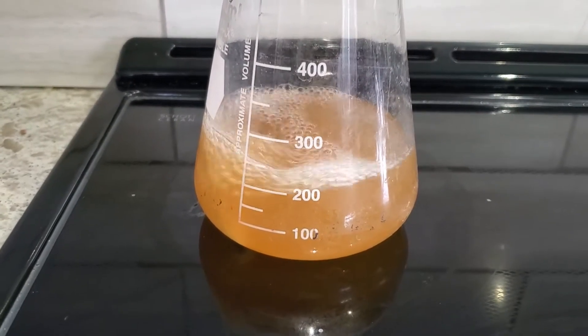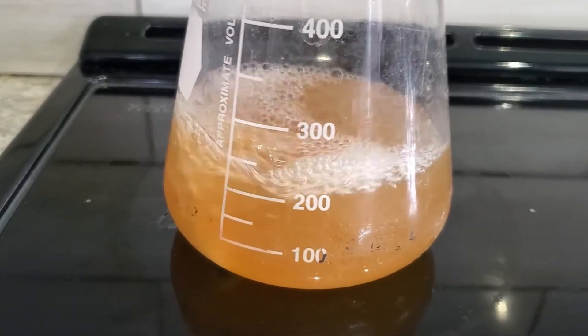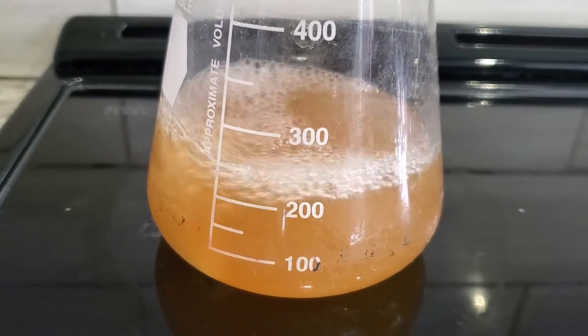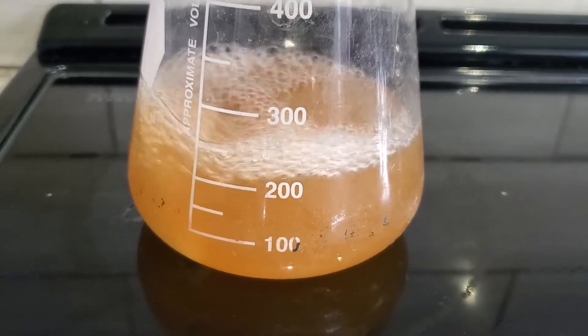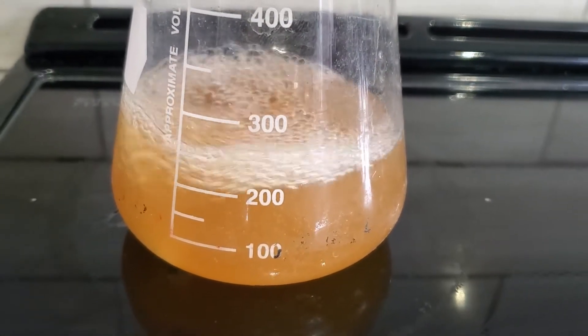I just hit a boil. I'm going to turn that down just a touch since it's a little more vigorous than I need, and I'll let it go for about 15 minutes, then turn it off. I'll let it cool down for a couple of hours on the stovetop out of the way, and then I'll toss it in the incubator.